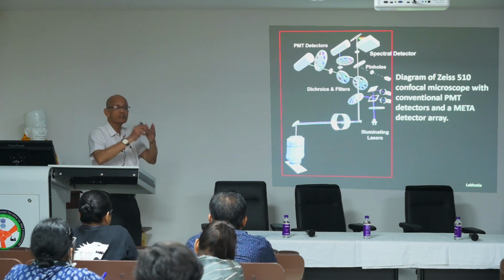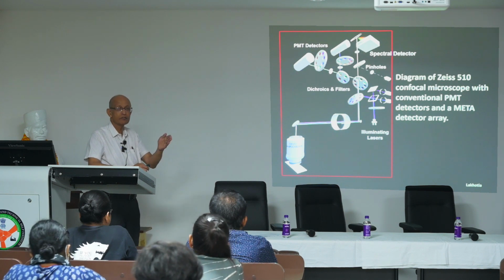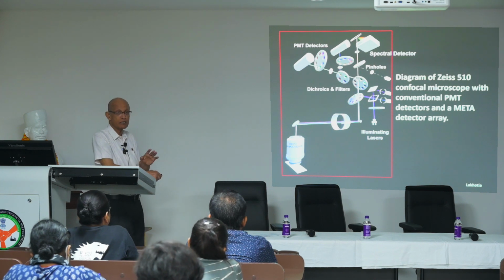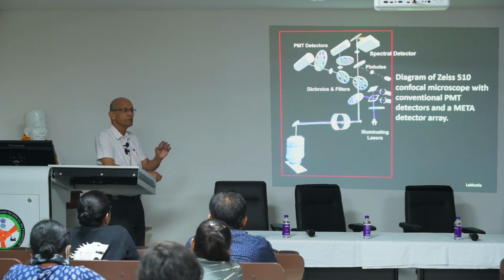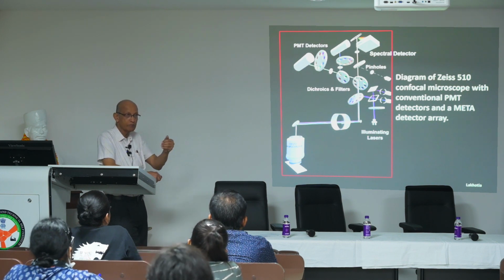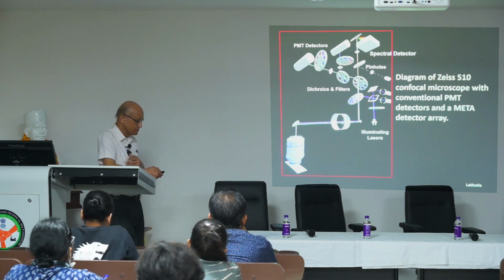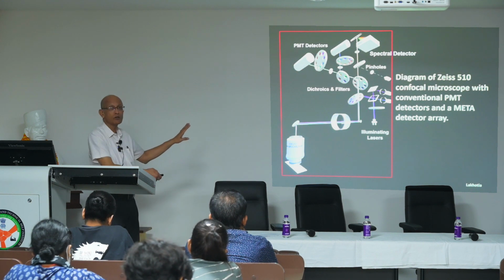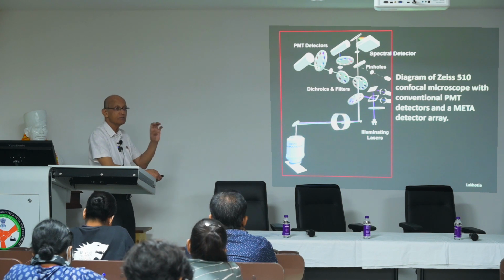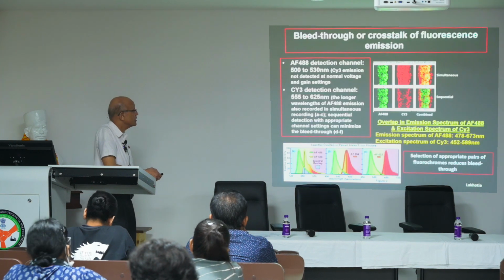And this will be combined with this scanning system. That again requires a mechanical system, that the stage moves in a particular direction or the pinhole moves in a particular direction. So depending on the different microscope, either the stage moves, or in most cases, it's a pinhole that is made to move. Both the pinholes, in the excitation path and the detection path, both pinholes must move simultaneously. And that's what makes the cost of the microscope, because this requires very high precision, not only the optics, mechanical components, but also the software component, which will regulate the whole thing.